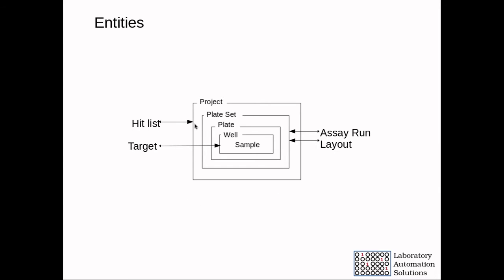Higher level entities, such as project, plate set, and plate, have dedicated pages in the LIMS Nucleus interface that contain a tool icon that provides the various functionality that can be applied to each entity.